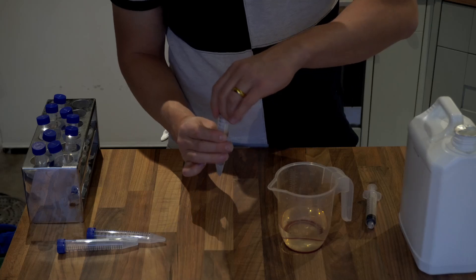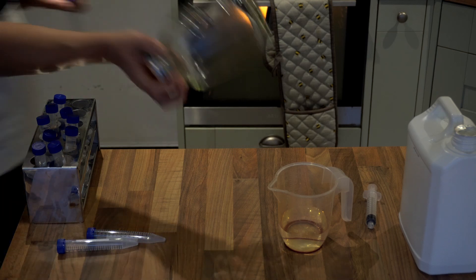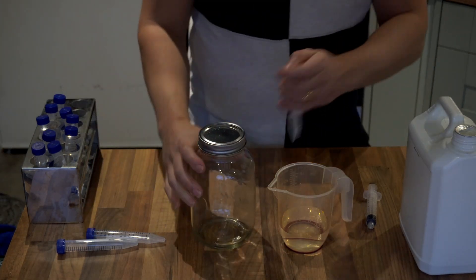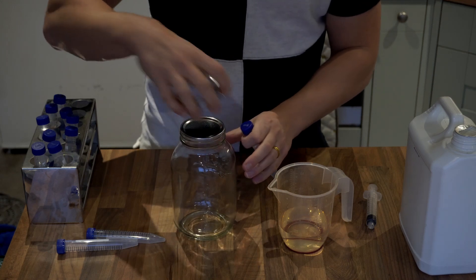To do this I just take all the test tubes and place them into a glass jar, and then I take them out of the glass jar when I get to my still air box, or in my case a laminar flow hood.